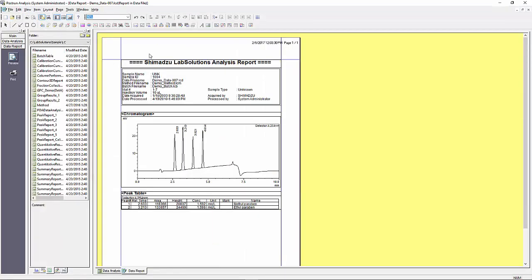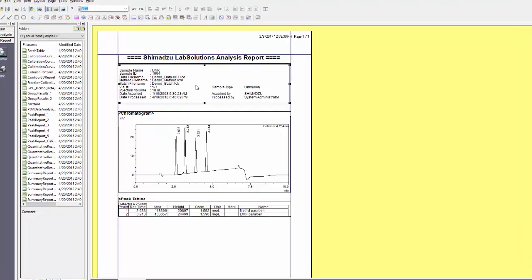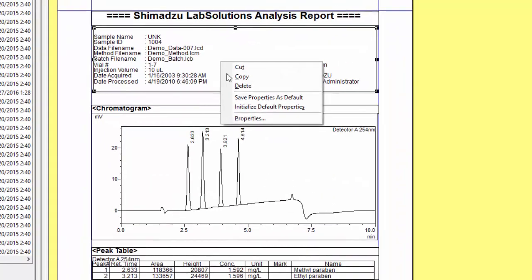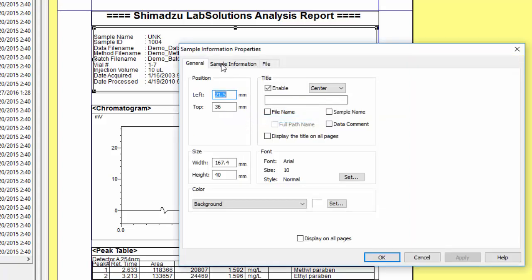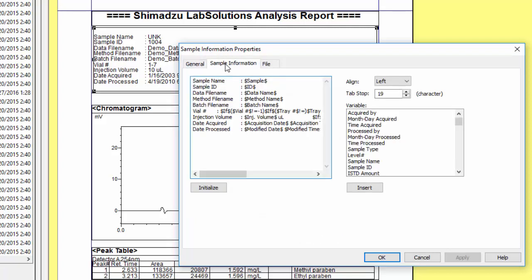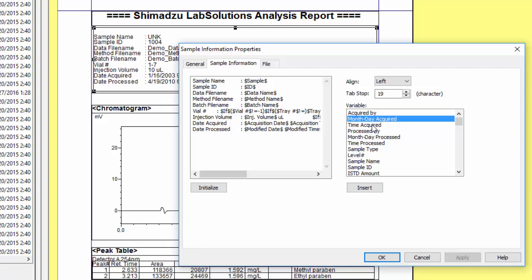When in report format editor, each item or field will have options associated with it. In order to make changes to a given item on the page, right-click and select properties. Depending on which item you are right-clicking on, you will have different options available. In this case I am right-clicking on the sample information field, which allows me to change the information displayed within it. The box on the left shows information that will be displayed in the sample information while the box on the right shows the variables you can choose to display.